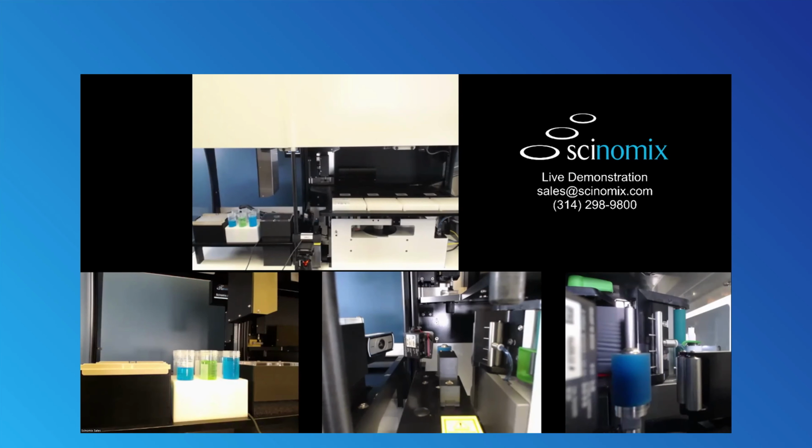When the run is over, it will return everything to its home positions. It will beep to let the lab user know that the run is finished. And then this is the point at which lab users are opening those doors and removing those tubes and sending them into whatever downstream process you have.